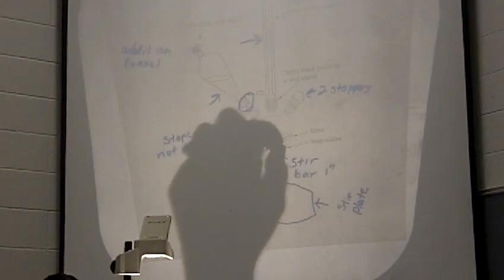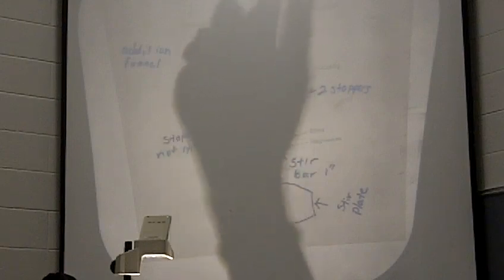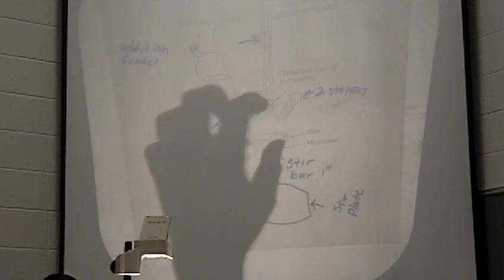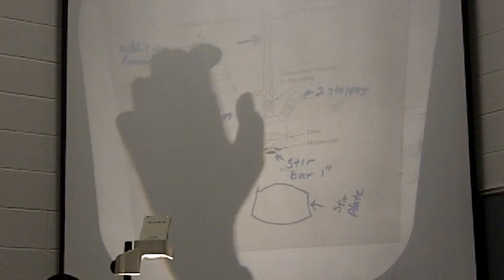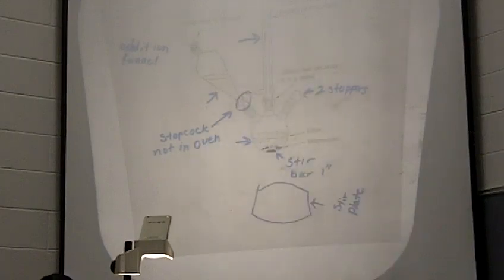So we'll put a couple of pieces of iodine in there, and then we're going to add our alkyl bromide slowly. You want to have this apparatus checked when it's set up like this before you add the iodine. When you have magnesium and ether in your round bottom flask, you have your alkyl bromide in your separatory funnel, you have your water connected to your condenser and it's running, and everything is clamped and ready to go.